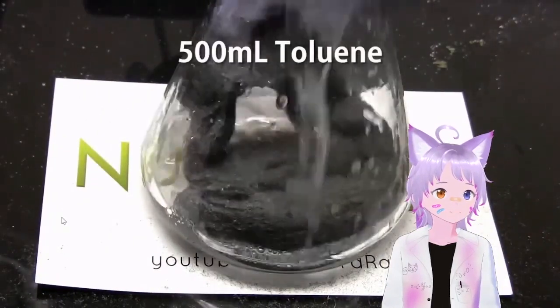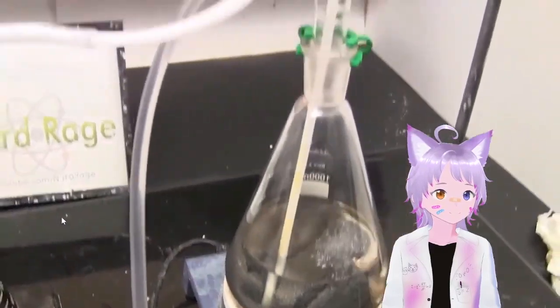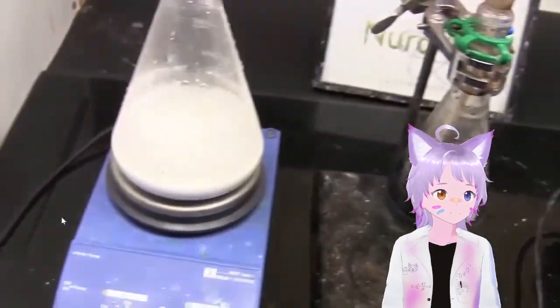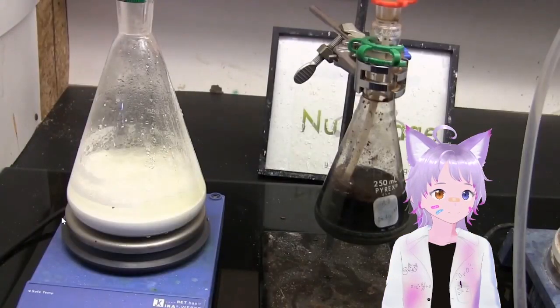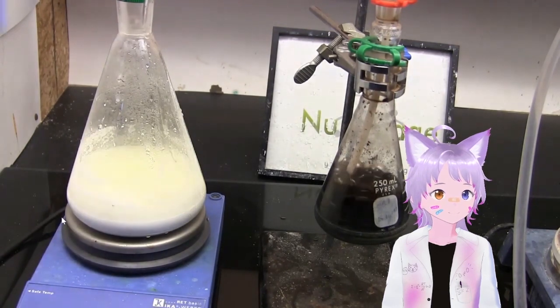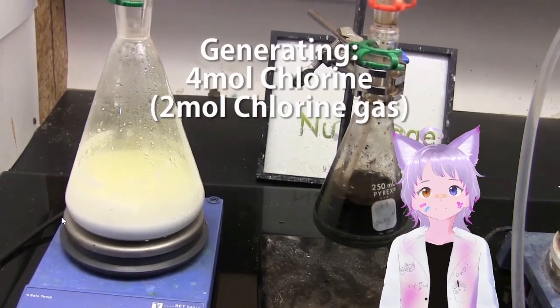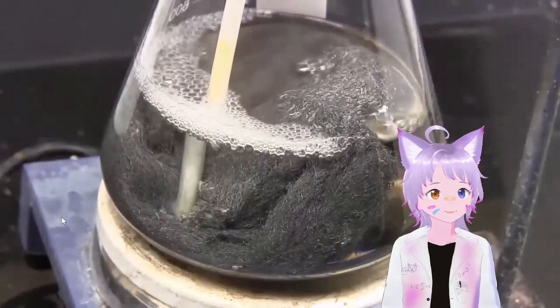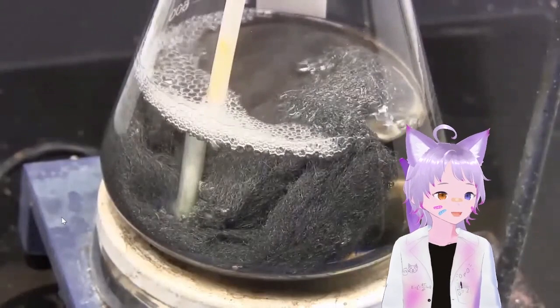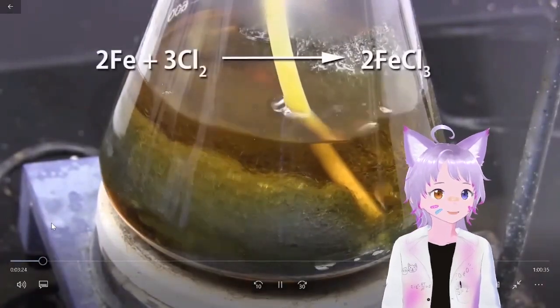Steel wool, toluene. His azeotropic separation step has to be done multiple times just to get it pure, if you remember.